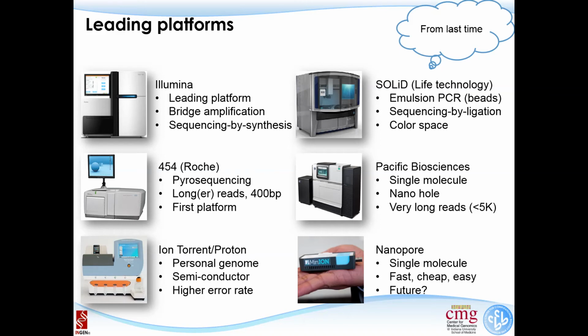For the current technology, even for Illumina, they have made a little bit of change, but you get the point. It's a very similar protocol.